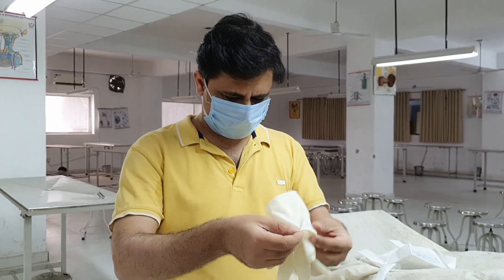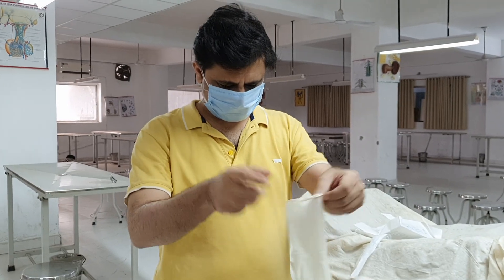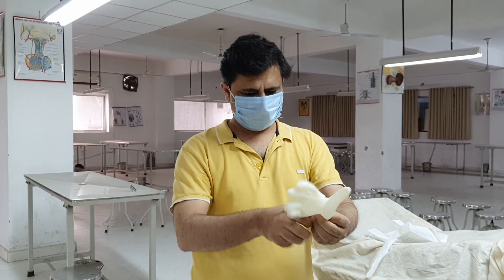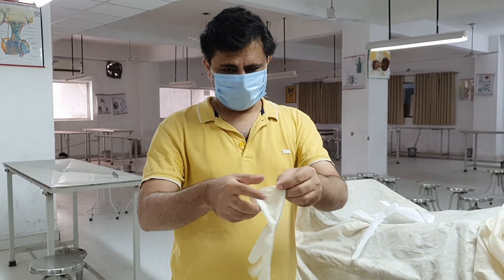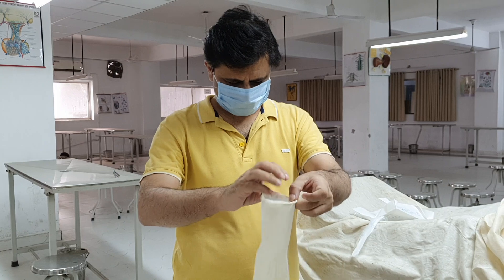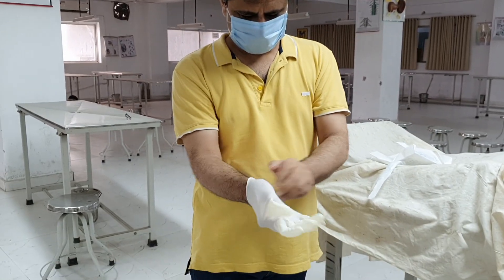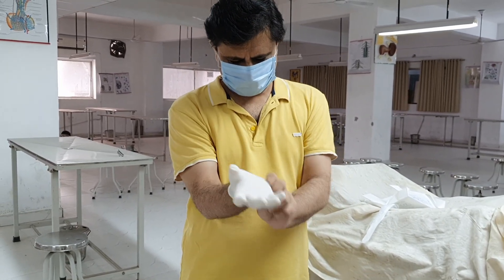These gloves, when you wear them, first pull them out like this and then fold it and make it like this. What happens is all the fingers, they are normally sticky, but sometimes they get inflated and it becomes easier to wear them.